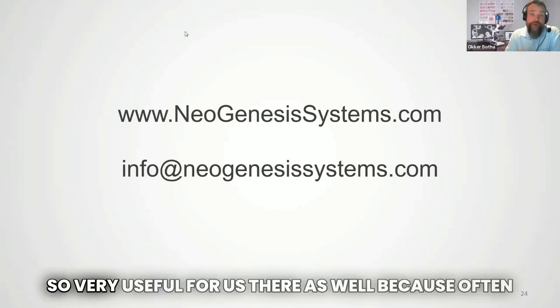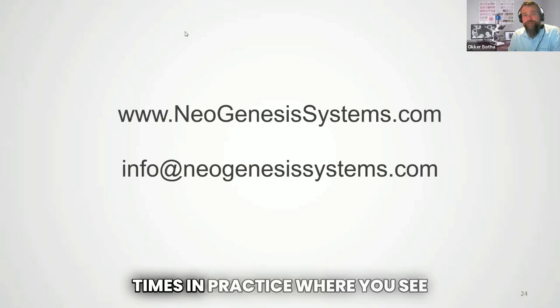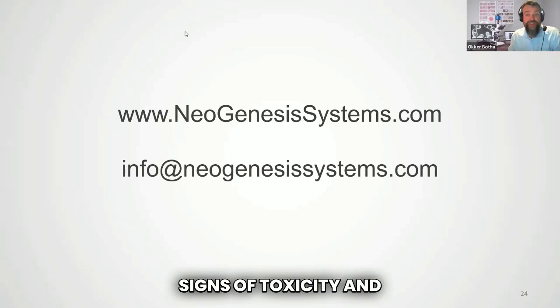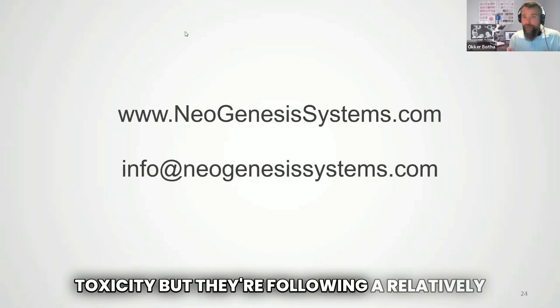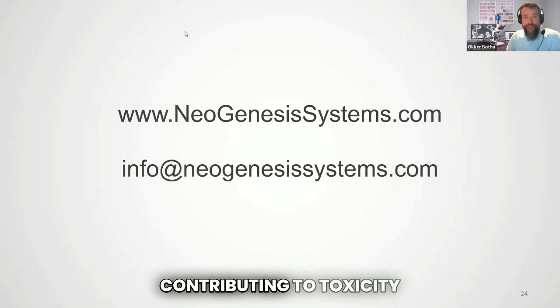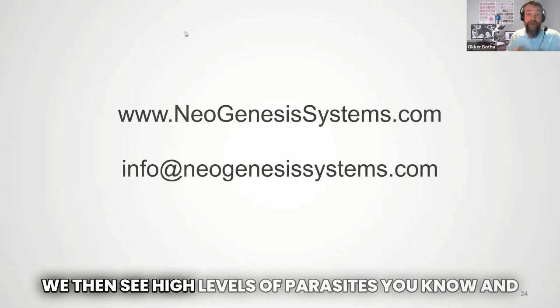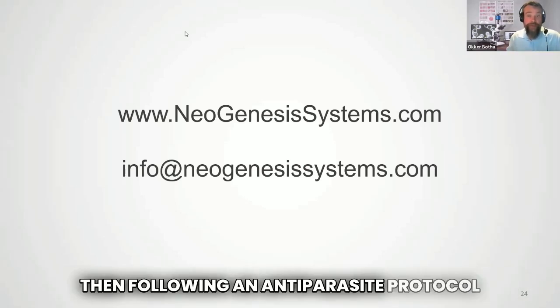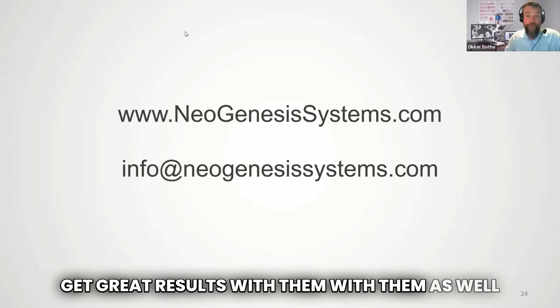So very useful for us there as well, because often, and we've had it quite a few times in practice, you see signs of toxicity and you see the client has high levels of toxicity, but they're following a relatively healthy diet. There's not much there that could be contributing to toxicity. But we look at the dry blood sample, we then see high levels of parasites, and then following an anti-parasite protocol with those clients, we get great results with them as well.